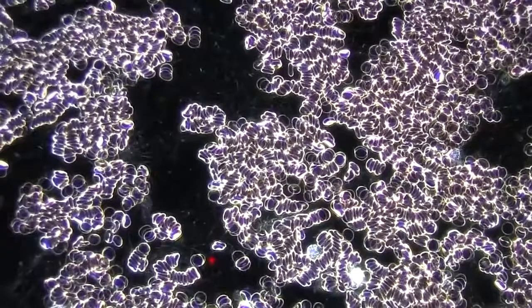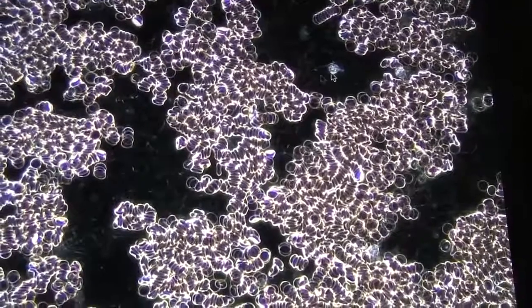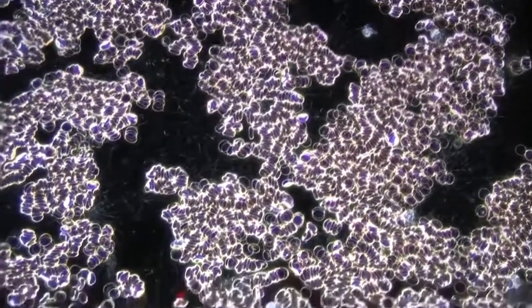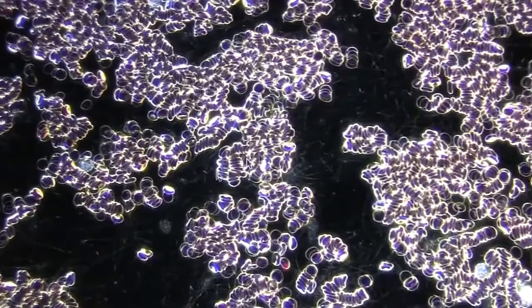Here we can see a very small white blood cell, actually. In the case of this blood sample, the person's white blood cells were too small. You can see this one here too. They should be 2 or 3 times the size of the red cells, and they're maybe about 1.5 times the size of a red cell. So they're not in ideal shape. This is the picture of a sample of blood I looked at within the last week.